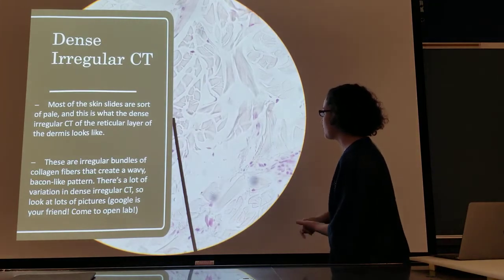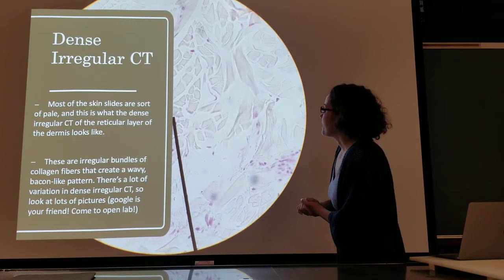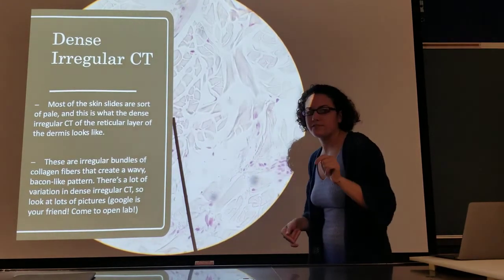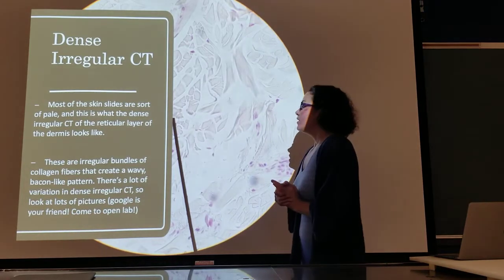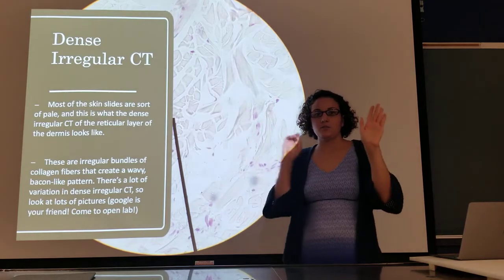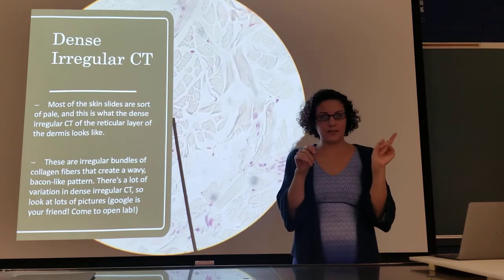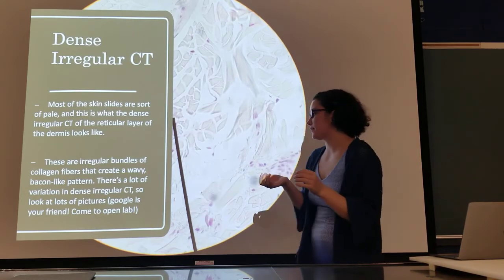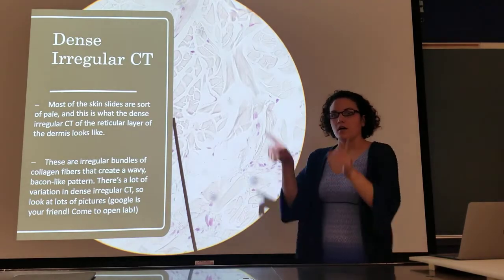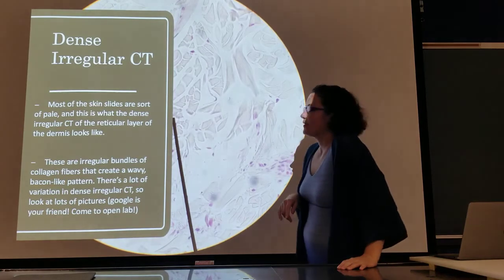And it does still have fibroblasts, which you can see, purple dots, all right? And it's located within the skin, specifically the dermis, but we'll get even more specific in a different video, all right? So you have proper versus specialized. Proper then gets split into dense versus loose, and dense gets split into regular versus irregular, all right? So it's a nice little hierarchy, little umbrella, pyramid, falling pattern.